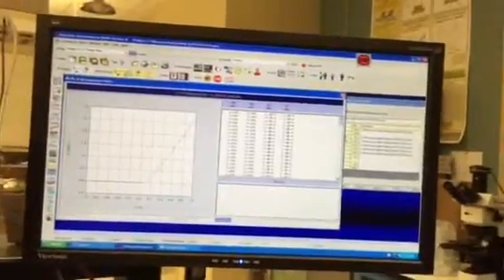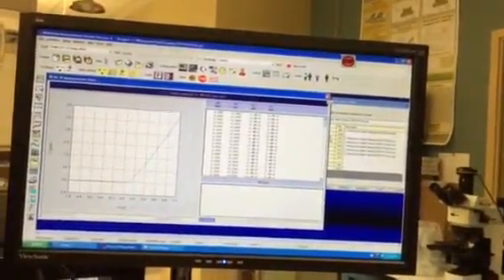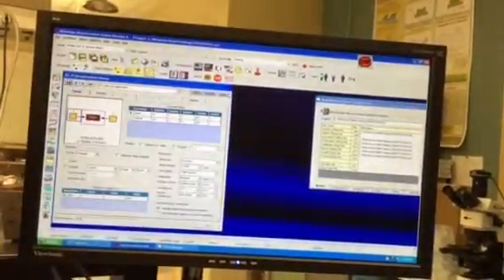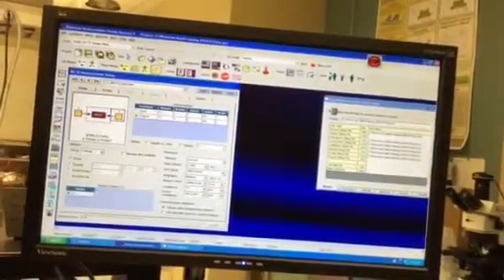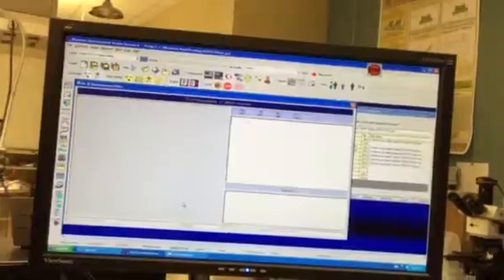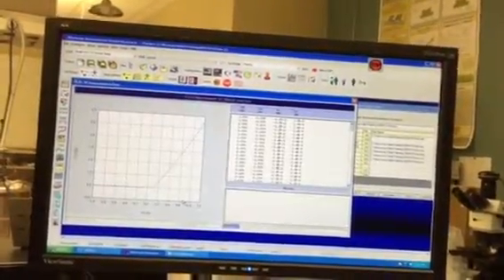Now the longer the integration time, typically the smoother the measurement will be, so you just have to decide how smooth the data needs to look. For instance, look at that one, and then let's change it to short and see if you see differences. Usually at lower currents it'll help, but you'll see it makes quite a difference in speed. See? That's what short is.